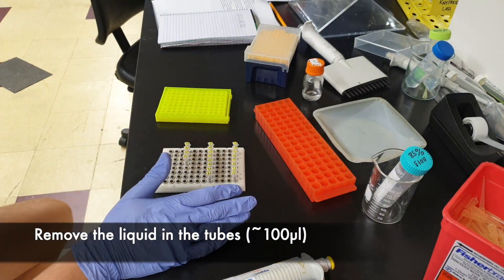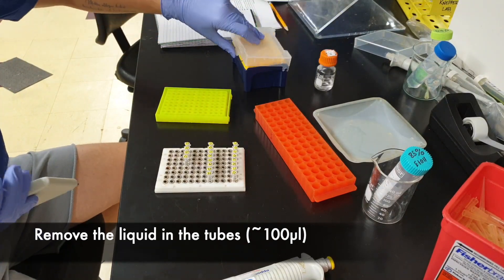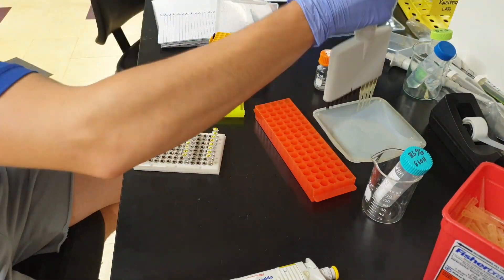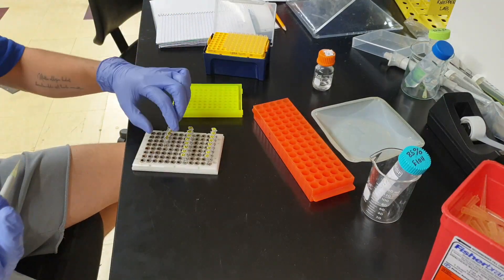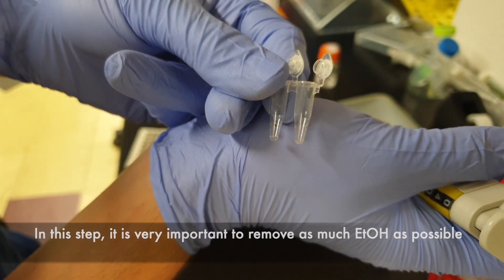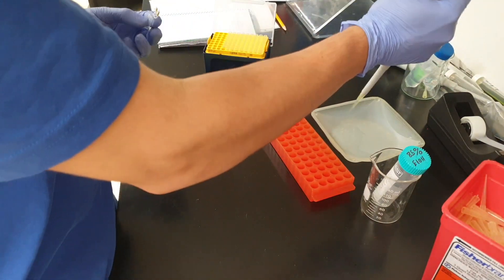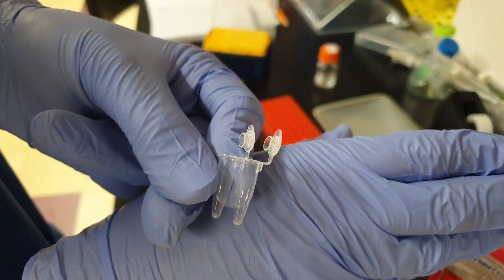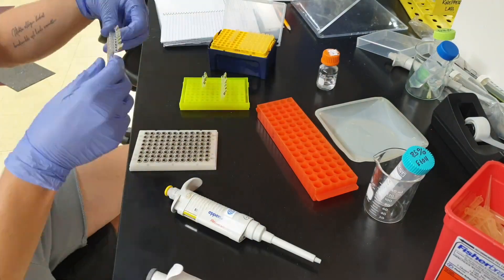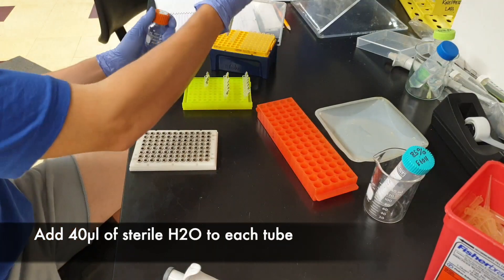We're approaching the last steps. Remove the ethanol inside, and after that we're going to add sterile water. At this step, you have to remove all of the ethanol. For example, one tube on the left side still has a little bit of ethanol left, so I'll remove it very carefully. Now they're all equal. Next, we're going to be adding 40 microliters of sterile water.